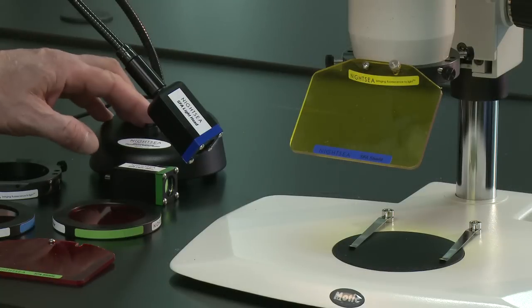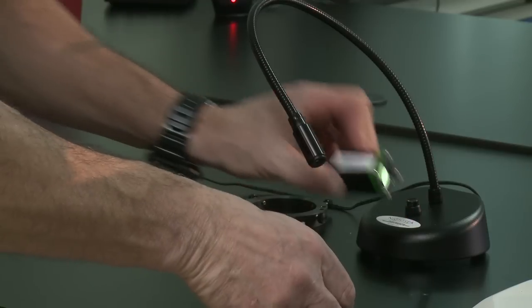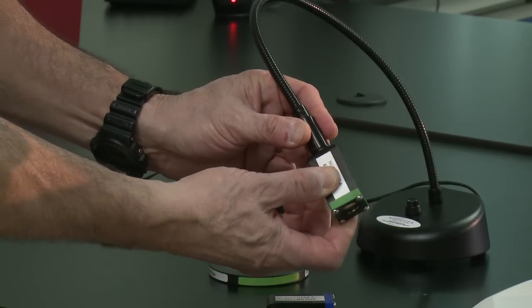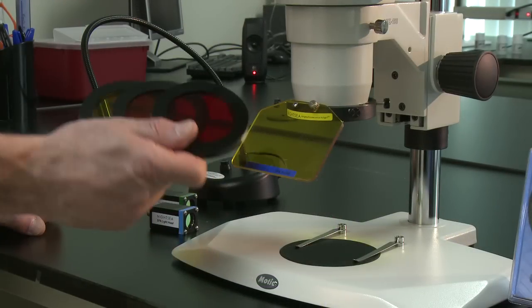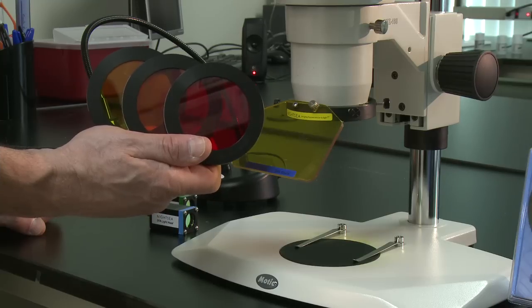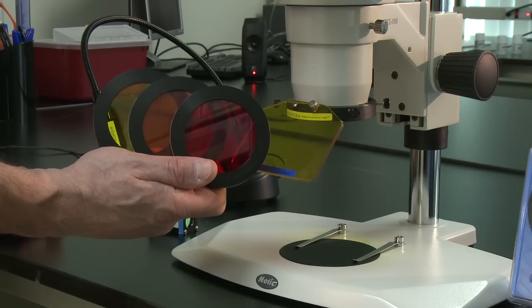The light source is a flexible gooseneck table lamp. The illumination modules are interchangeable — you can insert one color and leave it there, or you can easily switch among several color options. For barrier filters, we have optical-grade polycarbonate filters that mount beneath the microscope objective. These are supplied in colors that are complementary to the excitation wavelengths, producing excellent viewing contrast.